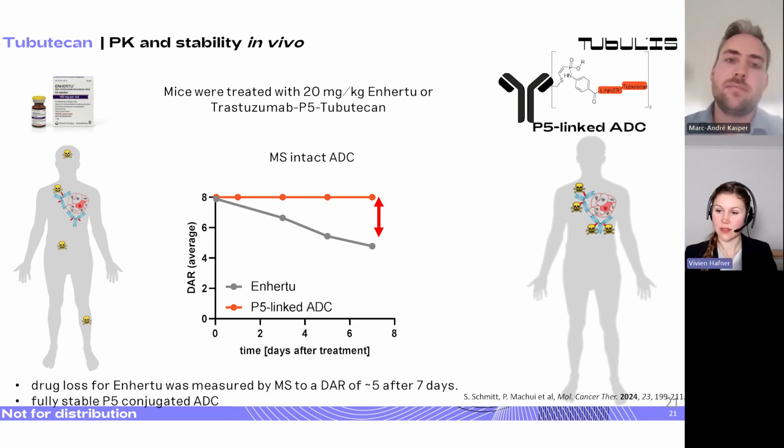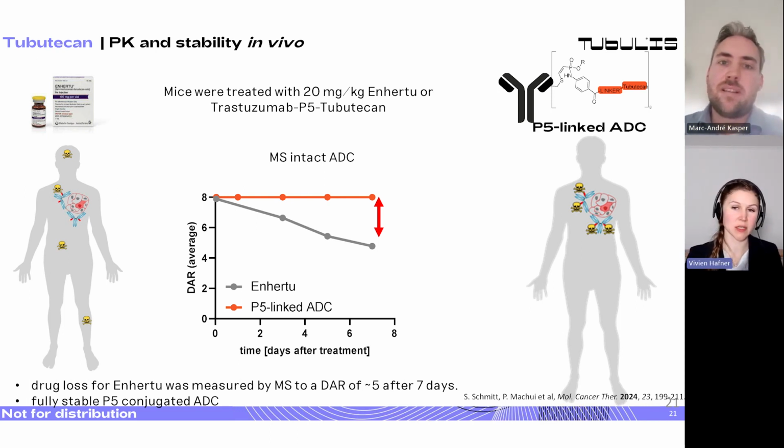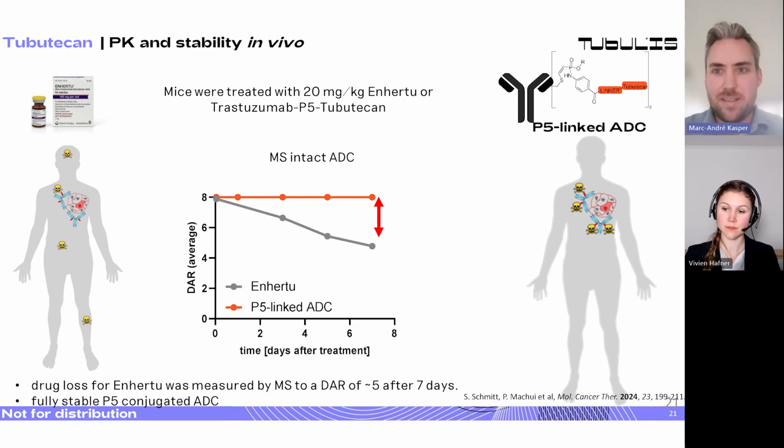And why do you think that this does not affect free cysteine conjugation from the variable domain and also not the eventual binding of the antibody? Yeah, usually we make sure when we select our antibodies that we do not have cysteines in the variable region, and they are also rarely found.